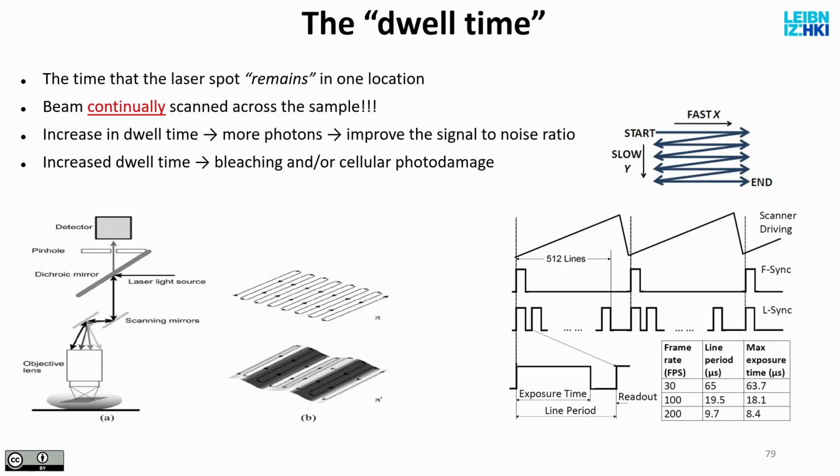And otherwise, the scanning is determined by a clock which tells the scanner when to move from left to right and up down for the Y. But otherwise, what I really want to emphasize on this slide is that the beams come.